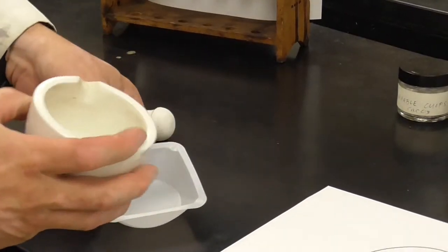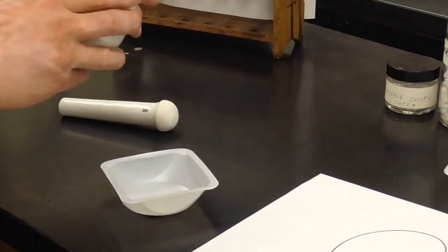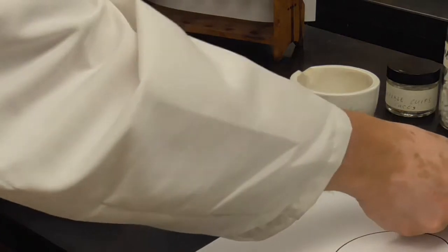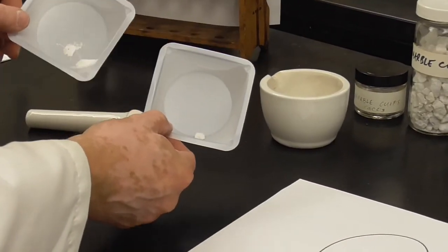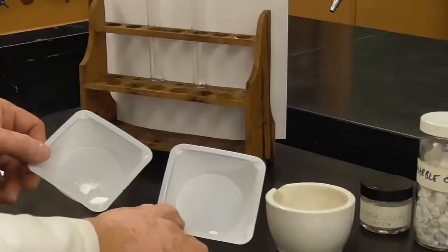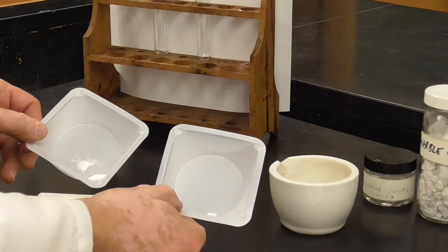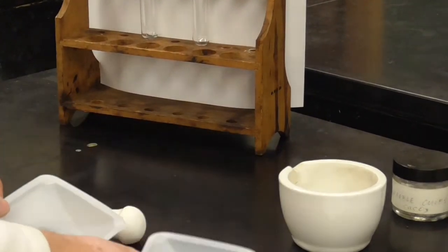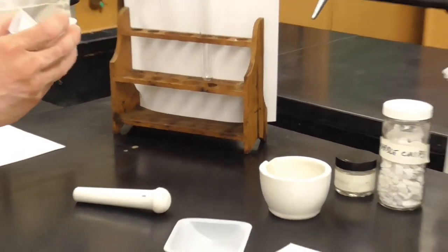Actually, you know what I'm doing? Go ahead and dump this out back into my weigh boat. Okay, so here's our comparison then. We've got a solid chunk, or we've got it ground up, so there's a little bit of surface area, or a lot of surface area. Those two. Okay. Let's go ahead and dump each one of these into a test tube.